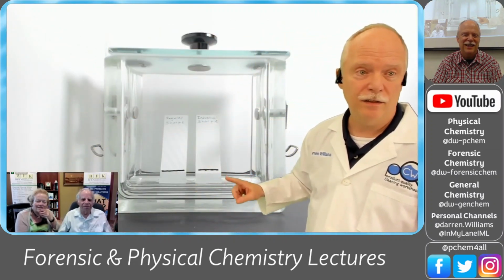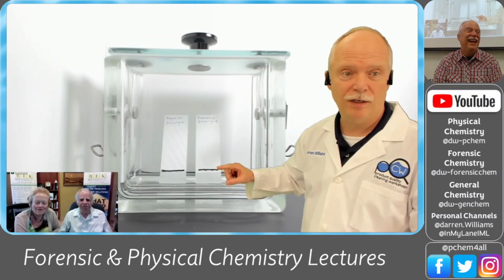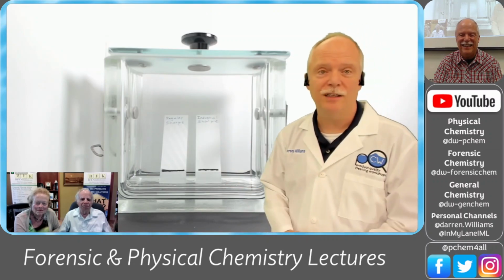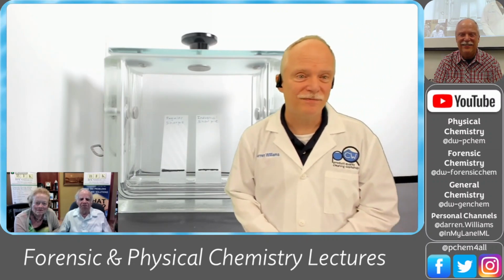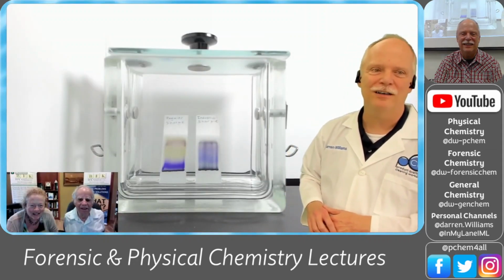You can see that ethanol line, the eluent, is pushing up, and it's going to interact with that black stripe, and it's going to push those compounds up, and then we'll stop it close to the end of the lab. You can tell that the industrial Sharpie and the regular Sharpie are fairly different.